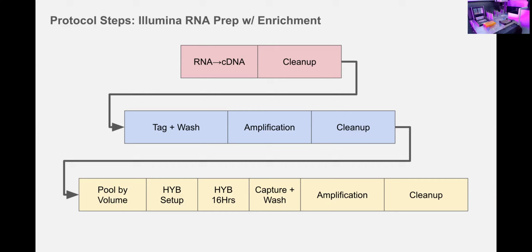So this chops up your DNA molecules and adds a little bit of DNA adapter so that you can attach your barcodes to it. Once you go through the entire blue series of steps, you would have a whole genome library that you could get sequenced on an Illumina-based sequencer. So all that was well and good.